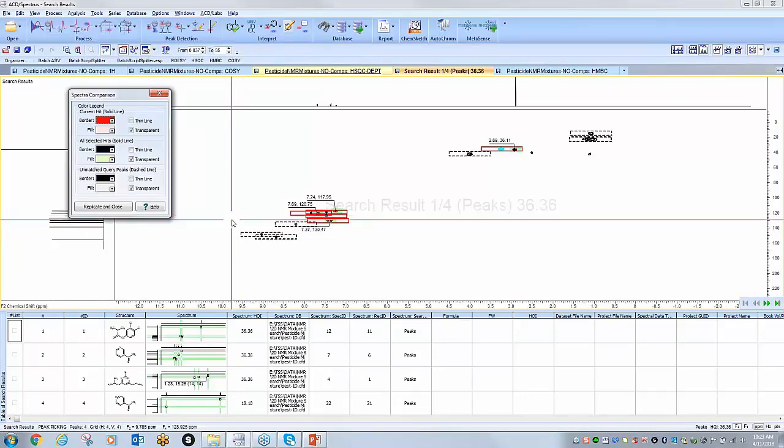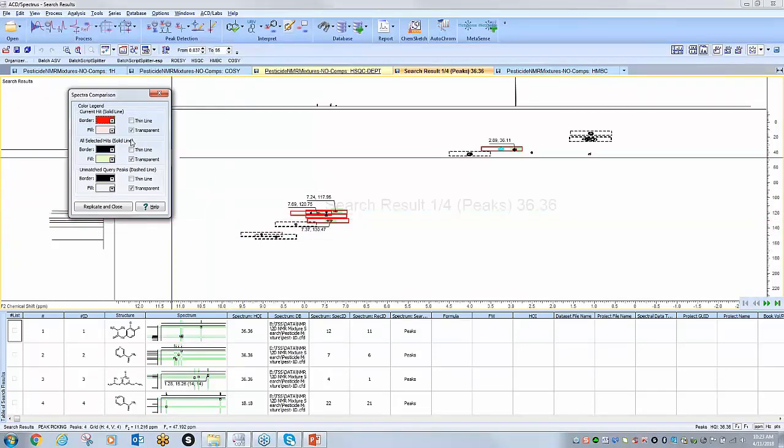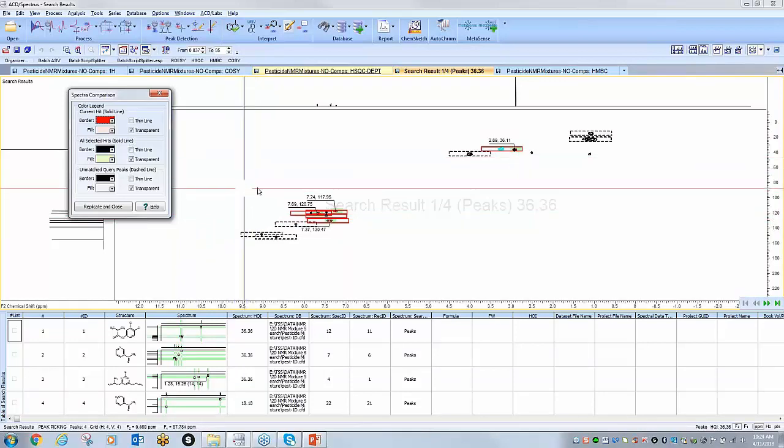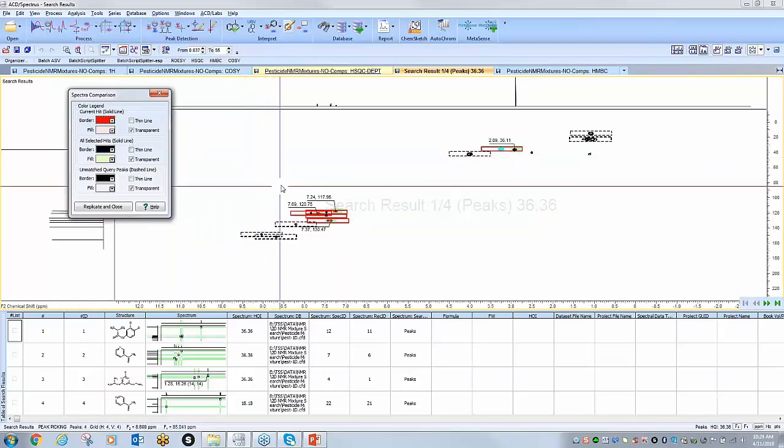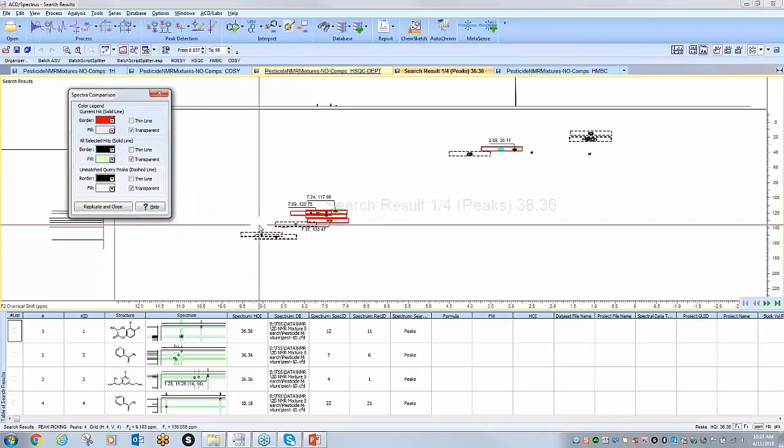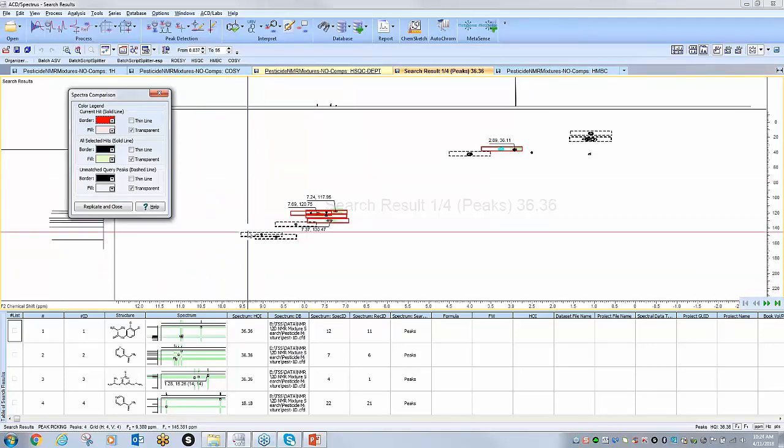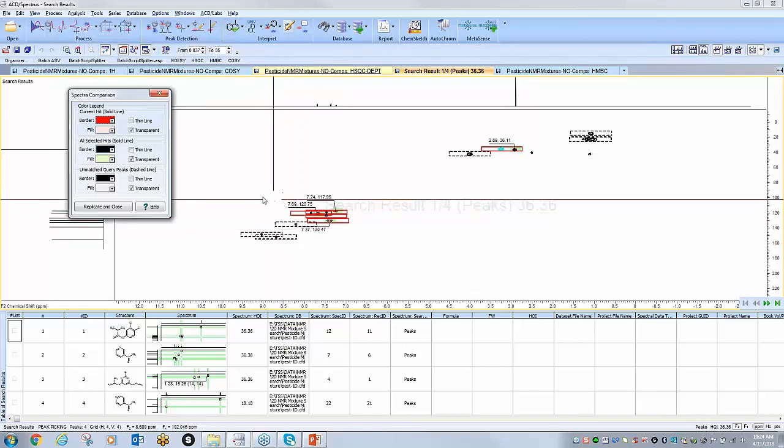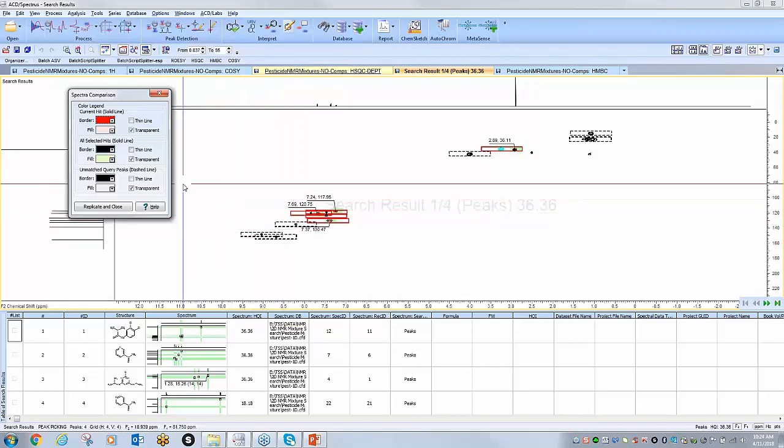We've also got the solid black lines, and these solid lines represent components or signals that I have identified from my list. So you'll see as I go through and work through this sample, some of the boxes will start to have a solid black line.